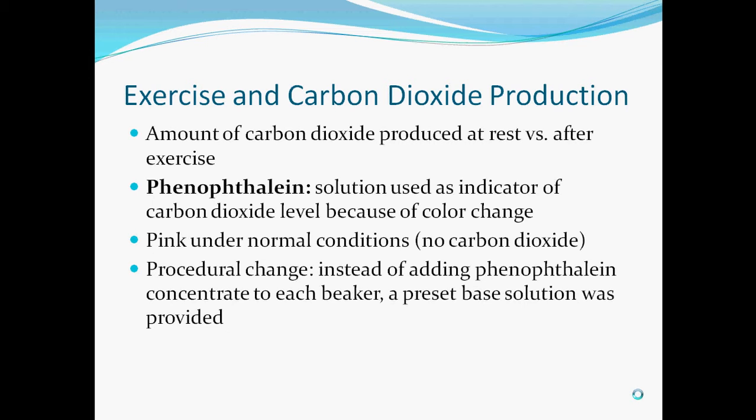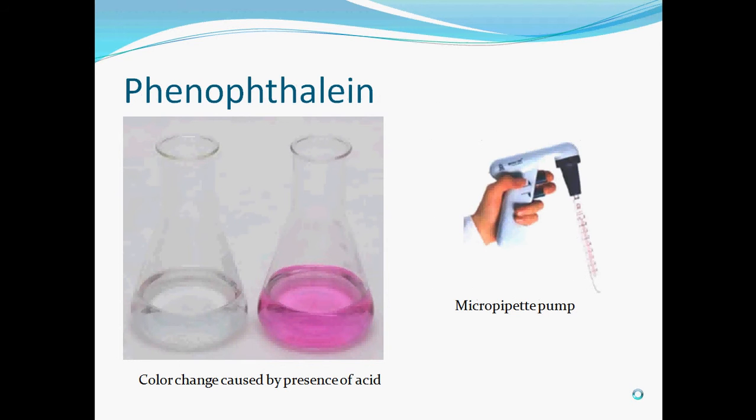from pink to clear. Note the procedural change that instead of adding phenolphthalein concentrate to each beaker, a preset base solution was provided. Here you can observe the color change from pink to clear, and on the right is the micropipette pump that was used to bubble room air through the solution.